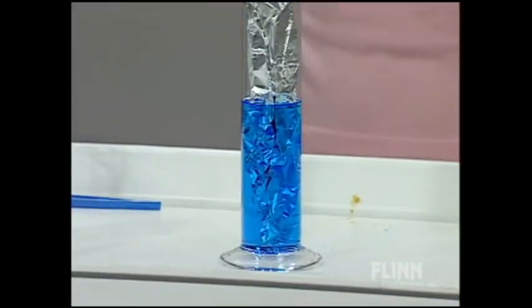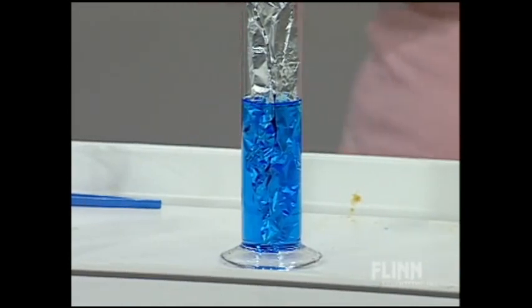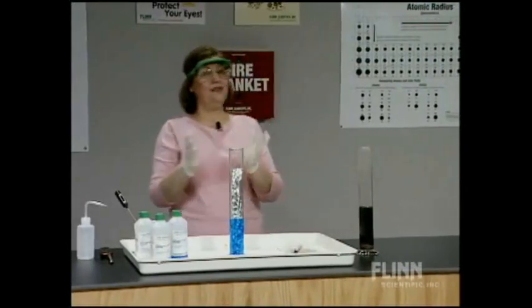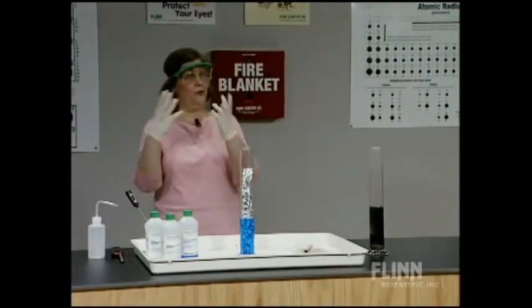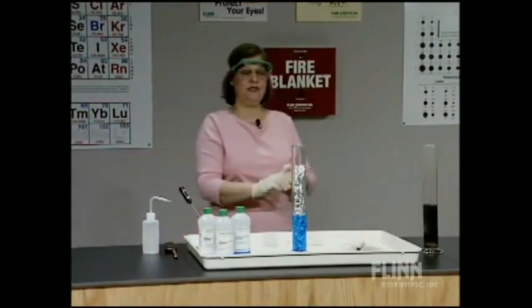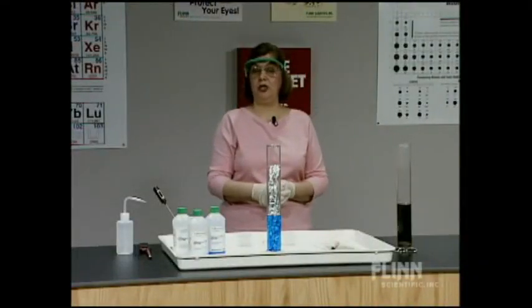I love this demonstration for a lot of reasons. It's a terrific introductory demonstration. But as with a lot of chemistry, or with life, there are layers to it, like peeling an onion. It turns out that it's not quite as simple as we first imagined, that we need something else there. When I have copper 2 sulfate and the aluminum foil, nothing happens, and we can wait quite a long time.